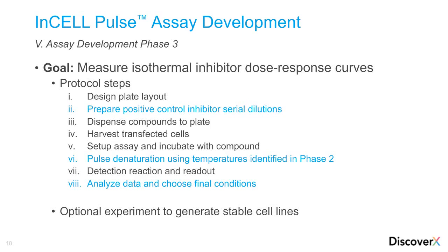And just some guidance here, you'd want to choose the lowest temperature that was acceptable and then a couple of flanking temperatures around this. And sometimes if you choose a high temperature, this affects the apparent affinity of the compound.